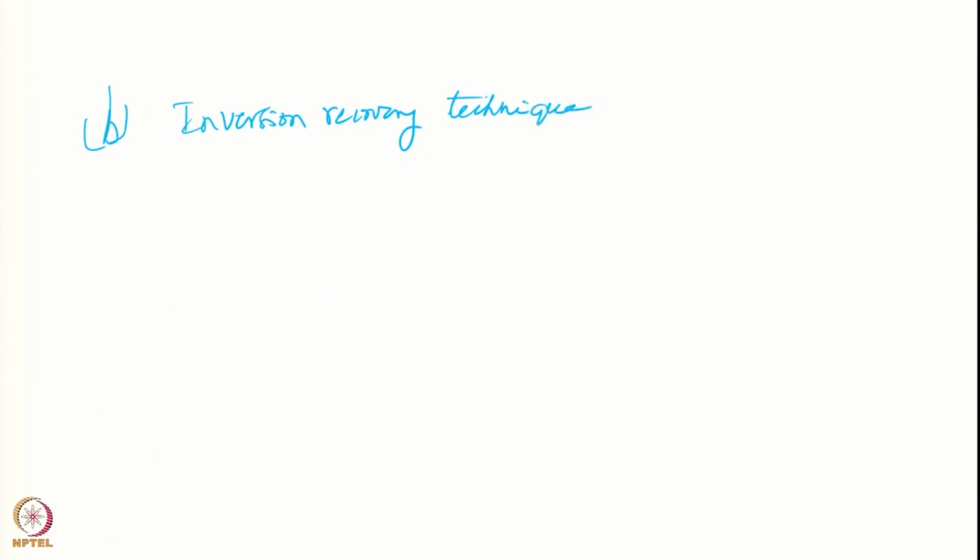So, what we do here is it actually uses more than one pulse. The strategy will be like this: you apply a 180-degree pulse, a hard pulse, wait for a time tau, and then you apply a 90-degree pulse or whatever flip angle you want to give, and you collect the FID here. How does this work? Let us try to understand this in a vectorial picture.